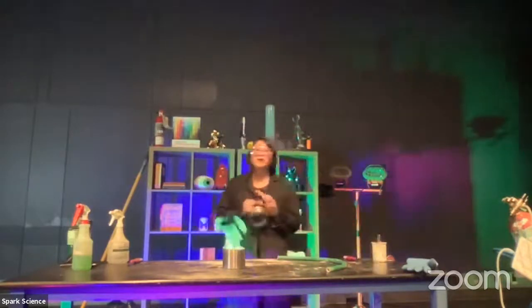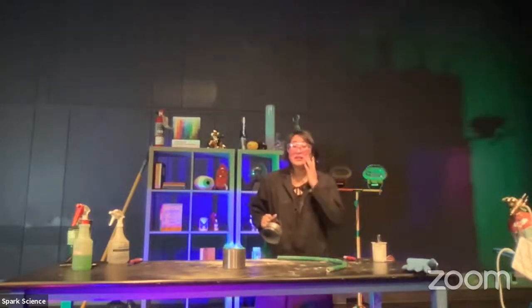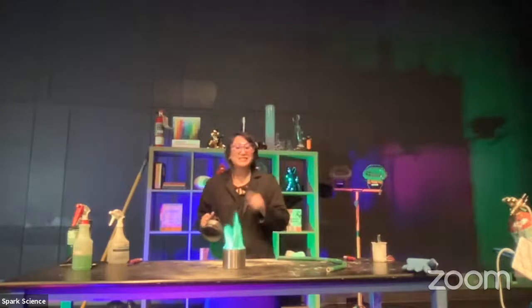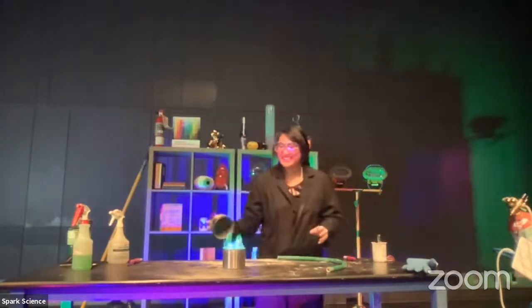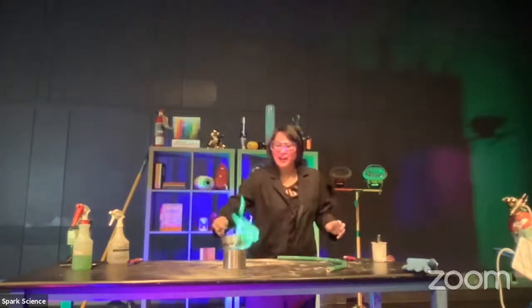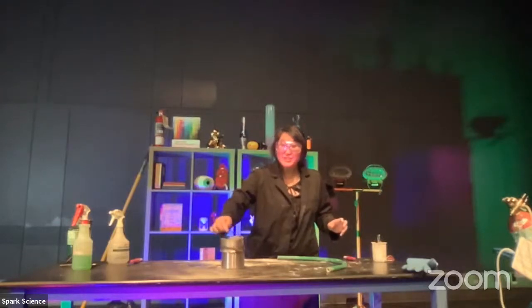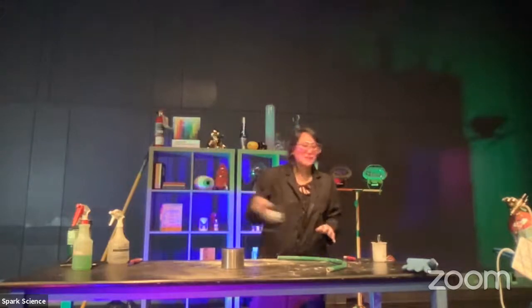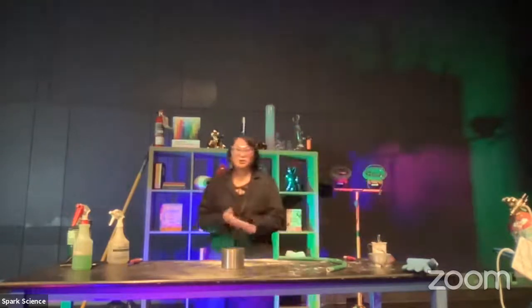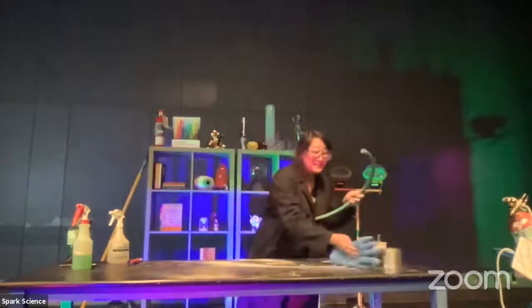Now, if we remove something from the fire triangle, you're not going to get a fire. So let's see what happens when I smother the fire or remove the oxygen. Ready? Here we go. Oh, it's still there. Got to do it a little bit longer here to get all the oxygen out. And in 3, 2, 1, it's gone. Once you remove something from the fire triangle, you're not going to get it again. That can be really, really dangerous.